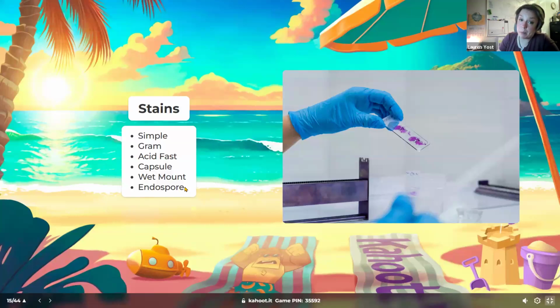So that's why I want to bring up paper towel was not important in that staining procedure. It was just a helpful tool. But we stained with the malachite green. We put the steam under it for 10 minutes to help force the malachite green into the endospores if there were any. Then we rinsed it off well with water, and that should decolorize any vegetative cells.